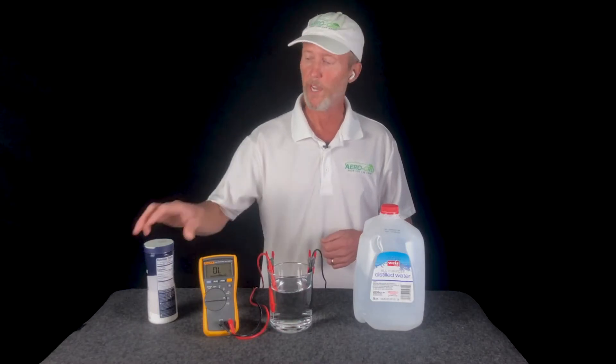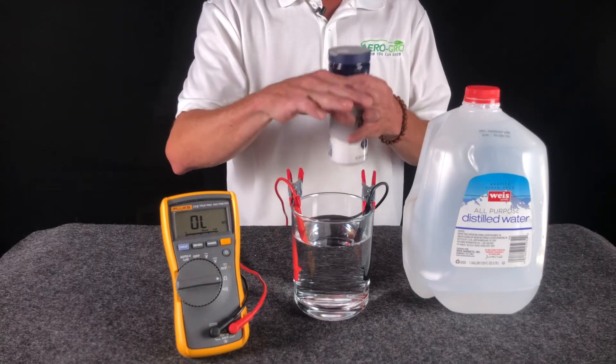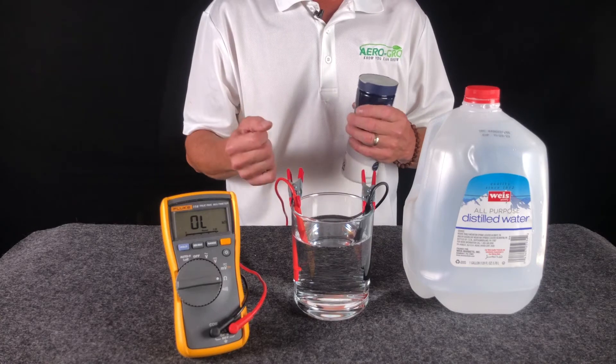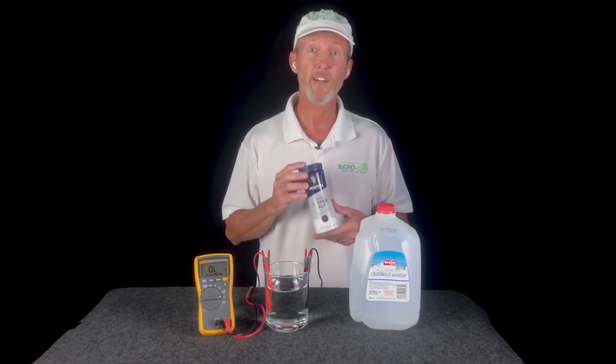So now when we add salt to the water, the numbers on the meter are going to go crazy, because as we add the salt and the salt dissolves into the water, the water becomes very conductive very quickly, and then the numbers start going wild. That's how your TDS meter works as well. Your nutrient solution is made of what are called nutritional salts, which are highly electrically conductive, just like table salt.